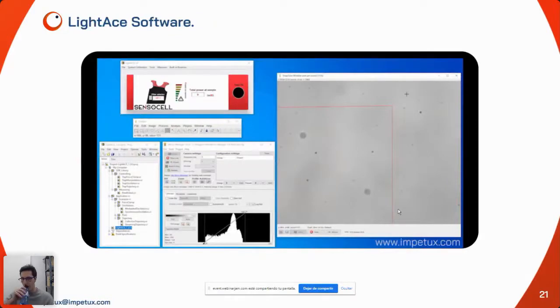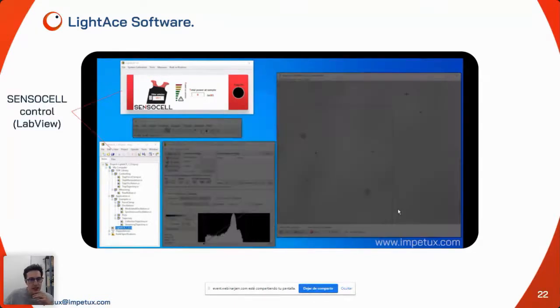Okay, so this is the software, how the software looks like. It's basically the integration of two softwares. From one side, we have LabVIEW. This is the main panel. Okay, this controls all the features of the SENSOCELL system. And this is the project window where we have different functions that you can use to build your own routines, okay, to program your own routines.